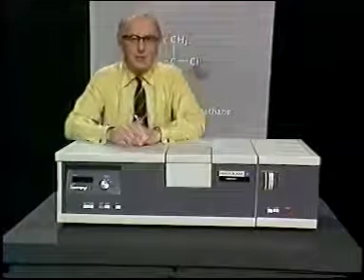Now let's have another look to see how our experiment is going on. As you can see, the readout is now minus 12 degrees. It's moved down from the minus 34 degrees that we started from, but as you can see, it is in fact still slowly going down. So what we can say is that the reaction is still not finished yet, is still going on.